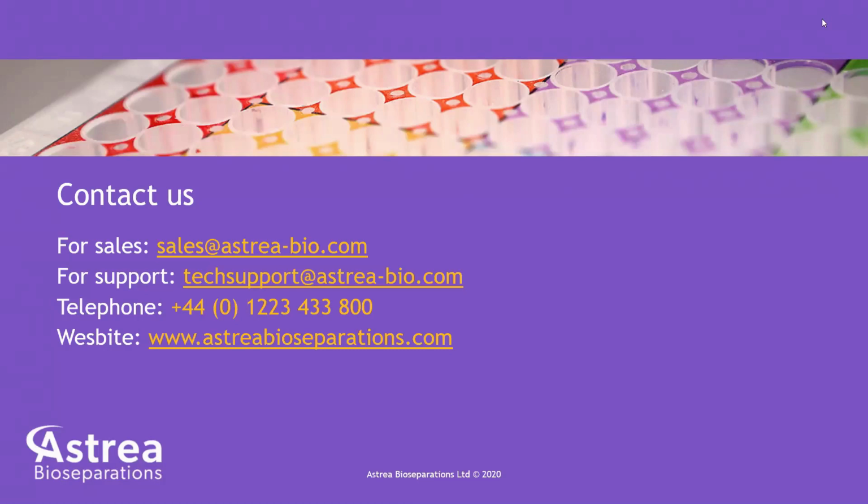Okay, then there was another question about the cost of these plates. Perhaps I could take that one. So you can get a single MMM library plate for around £400, but don't forget that does give you access to 2 or 3 small volumes of any hits that you do obtain. If you want that, more cost effective is to buy 5 plates, which comes in at around about £1,100. So there are different options there.